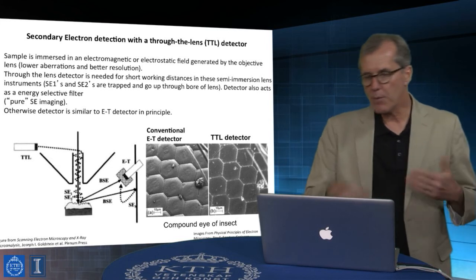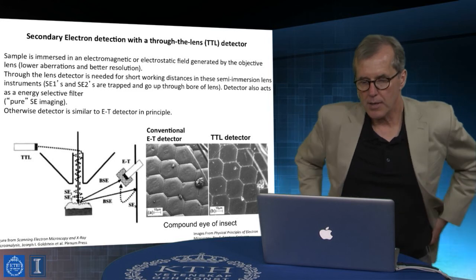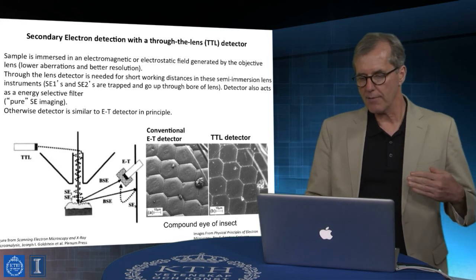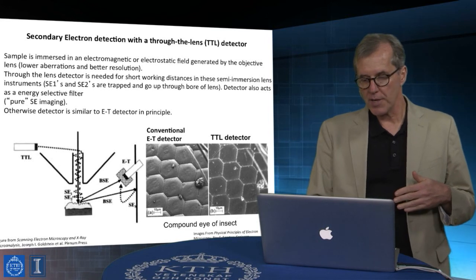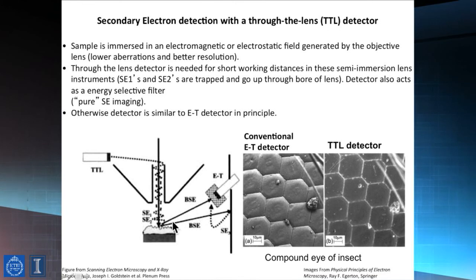Okay, so then we should talk about what happens with regards to other contrast mechanisms. Part of what we can do is to construct images which have different ways of doing detection. We mentioned that we could do detection with secondary electrons, and with backscattered electrons, and we can actually use other approaches for doing the detection.